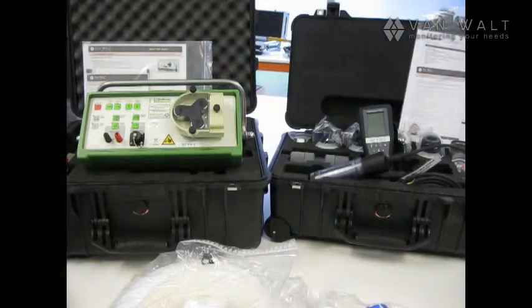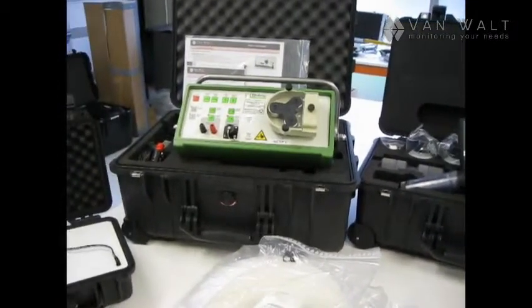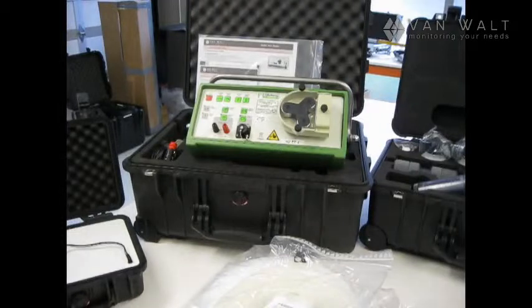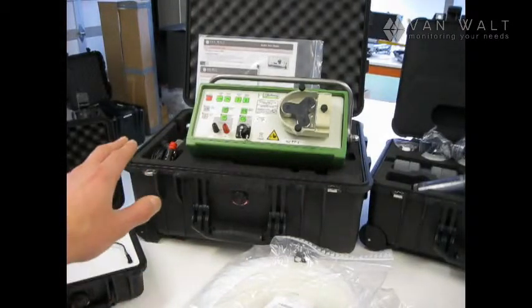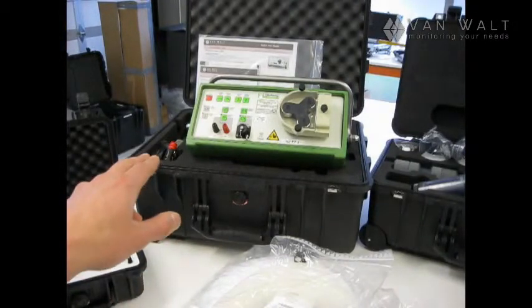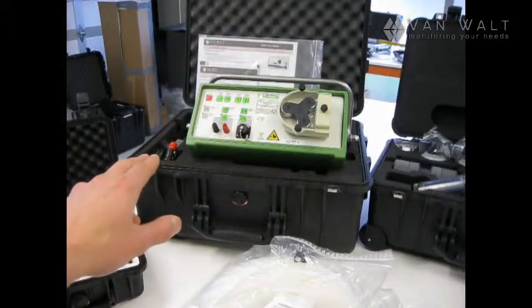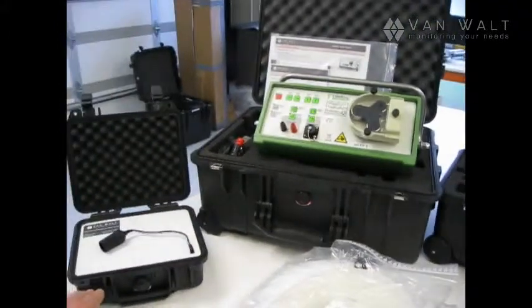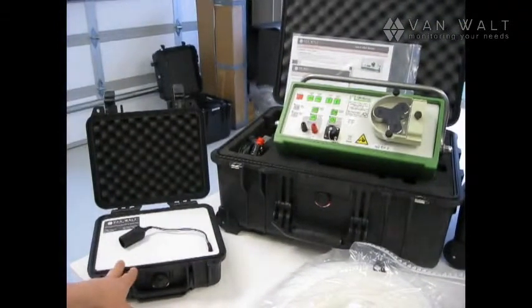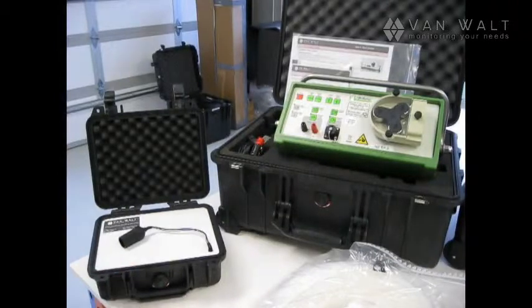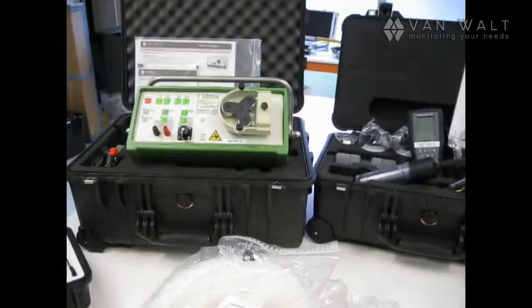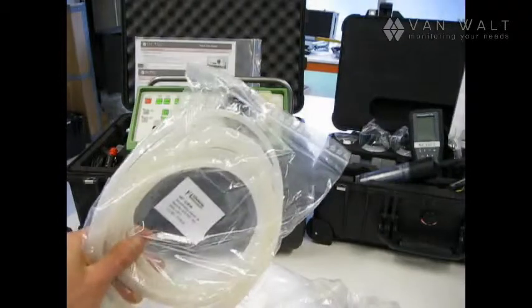First of all I want to show you some of the goodies available from us for low flow sampling. Let's start with a peristaltic pump and the pump comes with a charger and with an adapter for a cigarette lighter. Also we have available an additional battery pack and we have tubing available, silicon tubing.